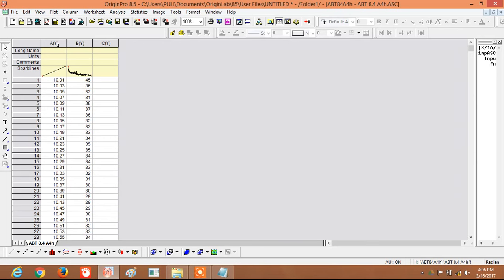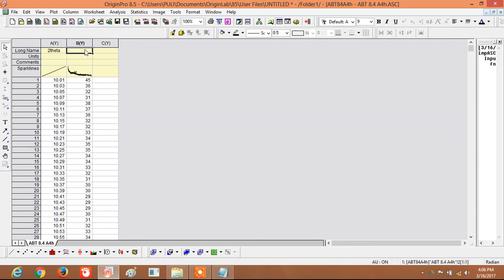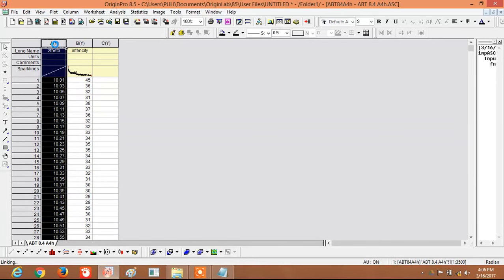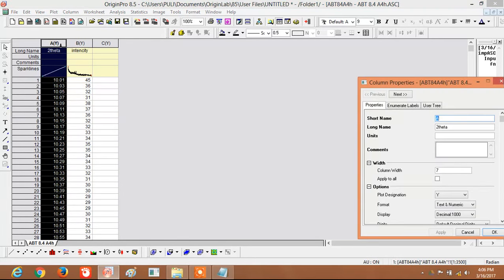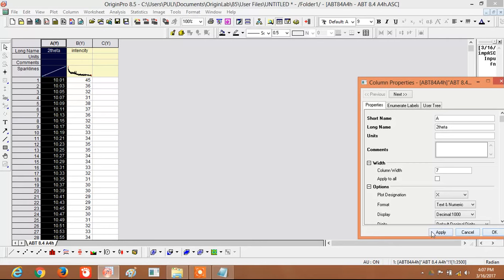The data is automatically updated here. This is XRD data, so the X-axis is Two Theta and the Y-axis is Intensity. You can see column A and column B — both are currently set to Y-axis. Double-click on the column to change its axis. Select X and click Apply.